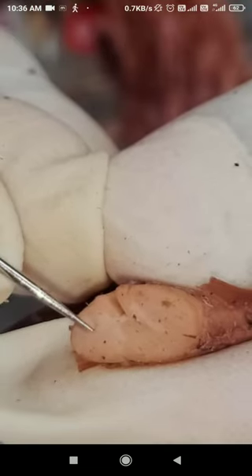This is a thoracic part of the spinal cord because there is a projection on the lateral aspect — we can see the lateral gray horn. They give the neuronal cell bodies of the pre-ganglionic sympathetic neurons. Dorsally, we can see the dorsal gray horn, thin, slender, and long, touching the surface of the spinal cord.